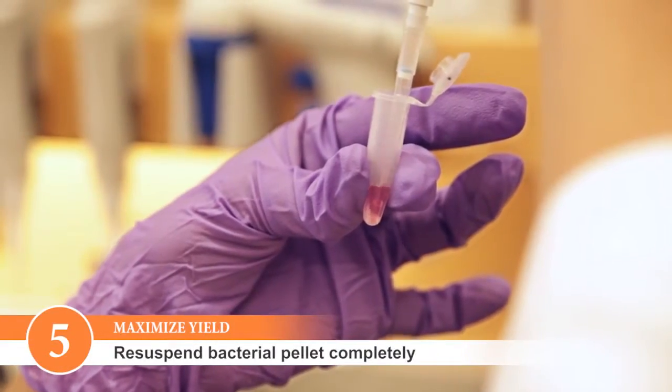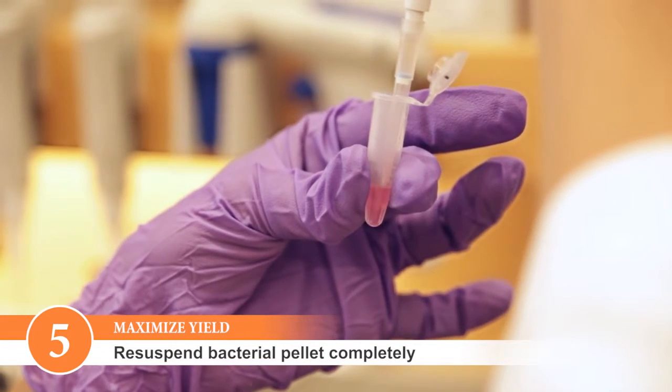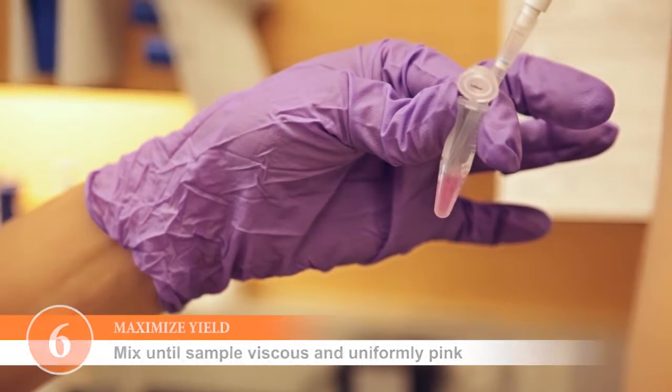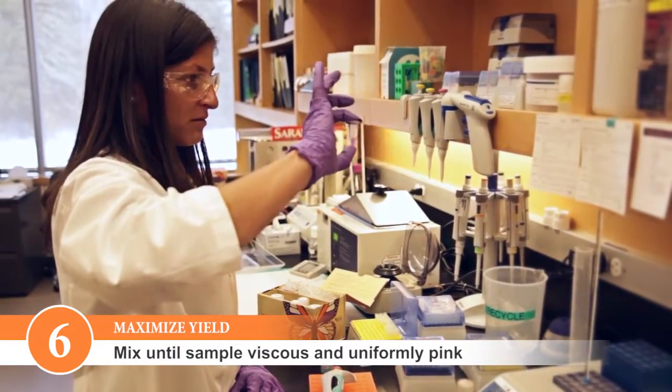Resuspend your pellet completely. Any bacteria that haven't been resuspended won't lyse efficiently, and the amount of DNA you will obtain will be lower. When lysing the cells, invert the tube several times so that the solution becomes viscous and uniformly darker pink.